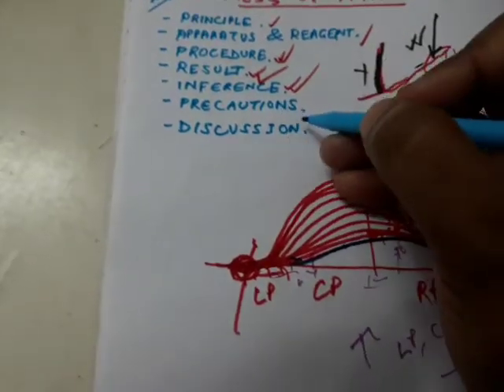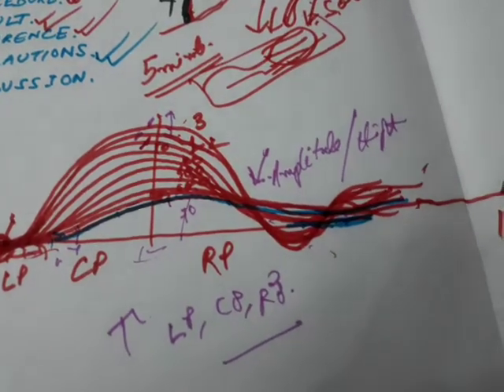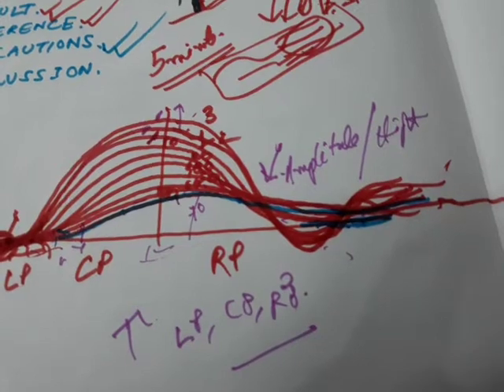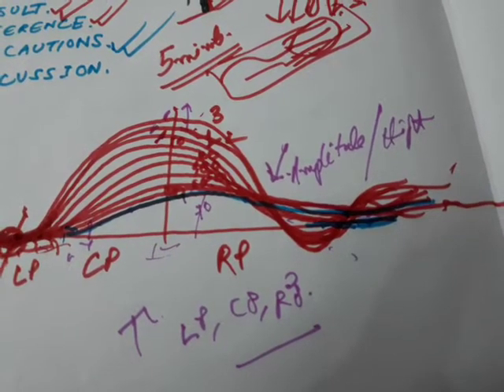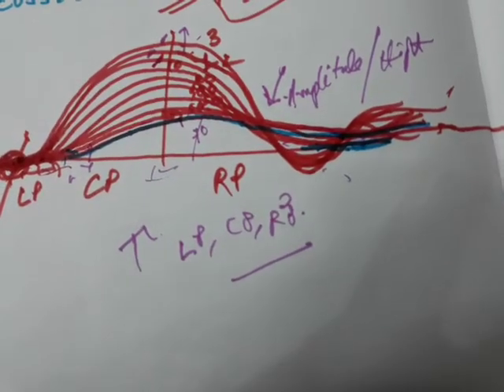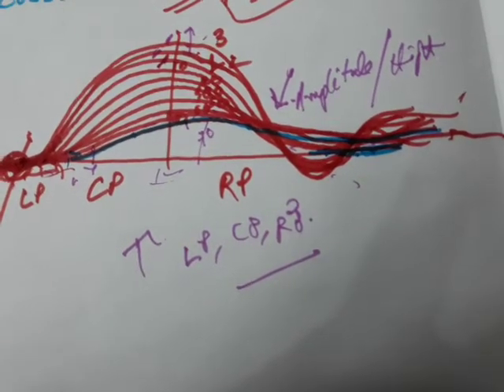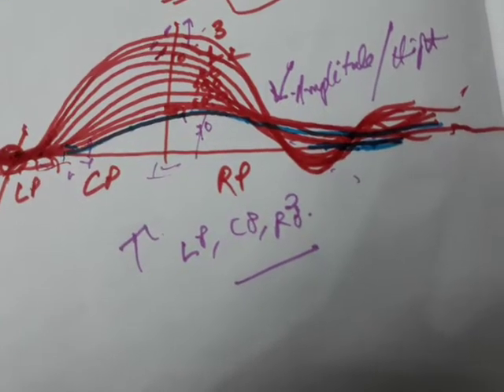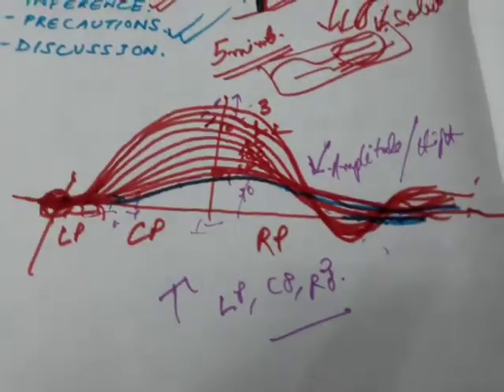So now about some precautions. The point of stimulus and the baseline should remain unchanged for recording the fatigue curve. Also, for recording the effect of direct stimulation on the muscle, the baseline should remain the same, but the point of stimulus should be changed. And lastly, rest the preparation for 5 minutes and keep pouring fresh Ringer solution in order to record the response of the muscle after recovery. And also there are some other precautions which are the same as simple muscle curve.